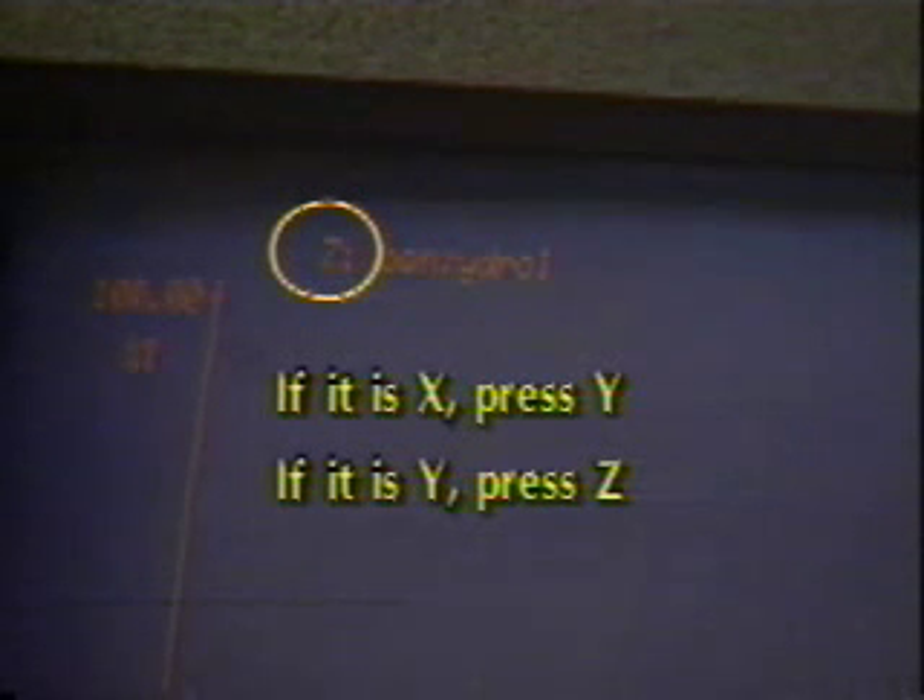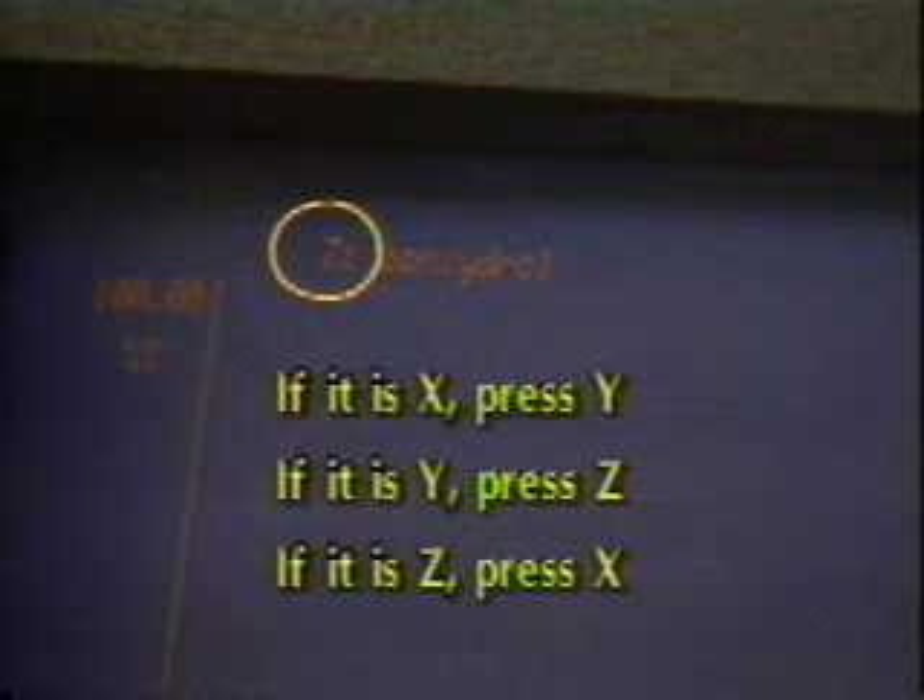To scan a sample, press scan first. Then choose which storage region to put your spectrum into by pressing X, Y, or Z on the touchpad. If there is a line of students running spectra, it's best to choose according to alphabetical order to prevent erasing a spectrum which has not yet been plotted. Therefore, look up on the screen — the letter of the storage region of the last scanned spectrum will appear in the upper left-hand corner. If it is X, press Y. If Y, press Z. If Z, press X. The current letter is Z, so choose X.